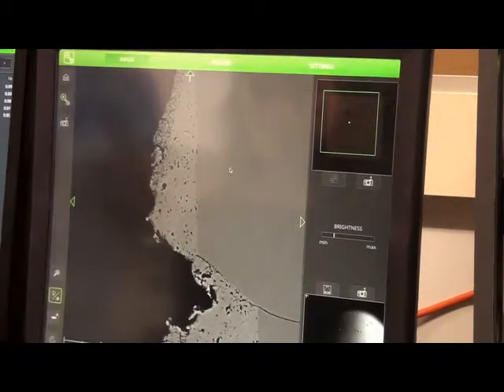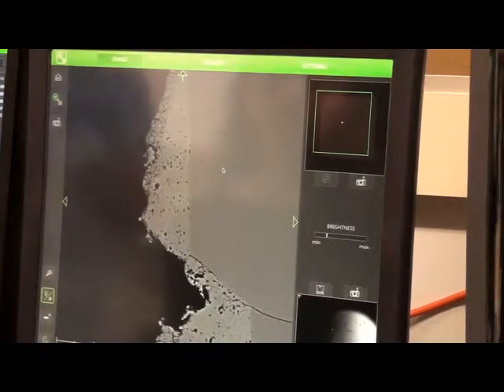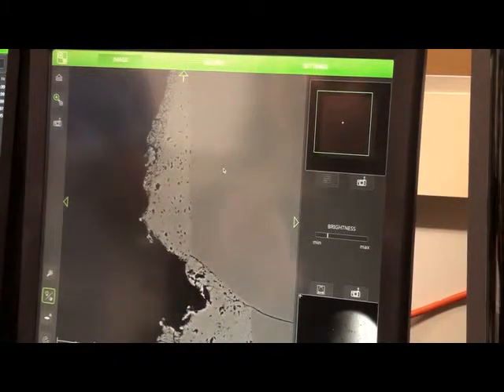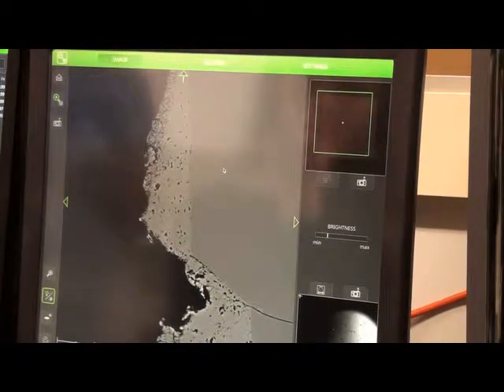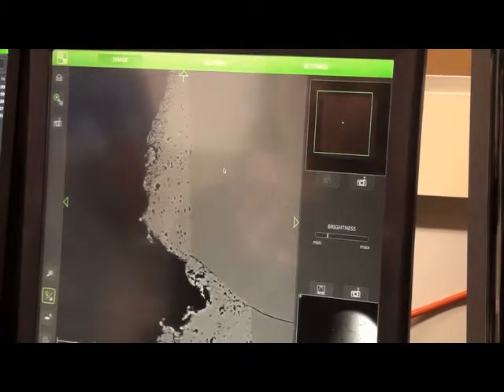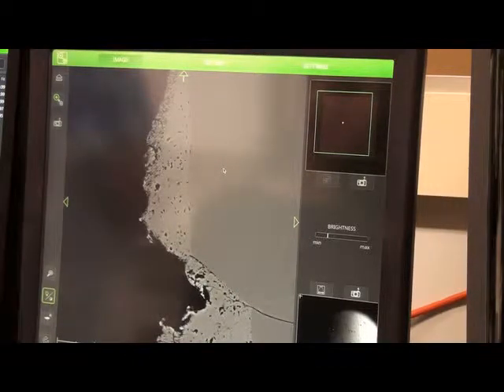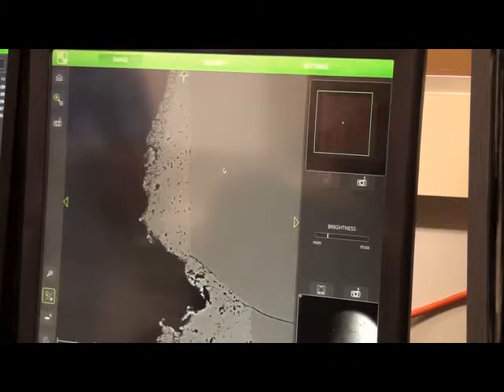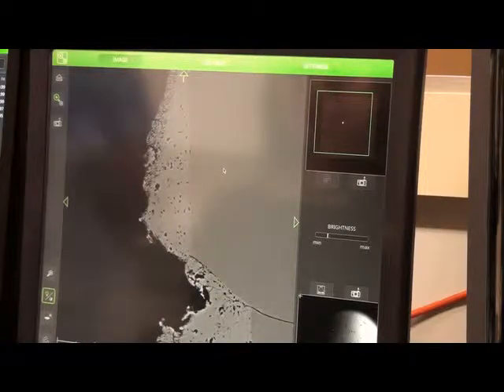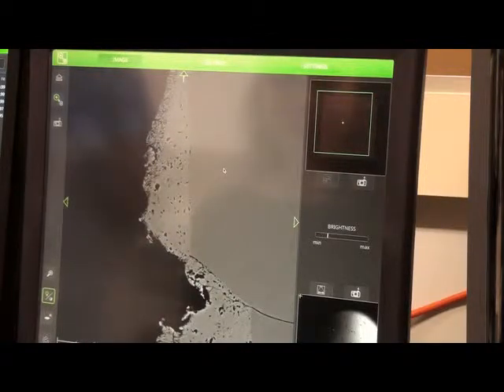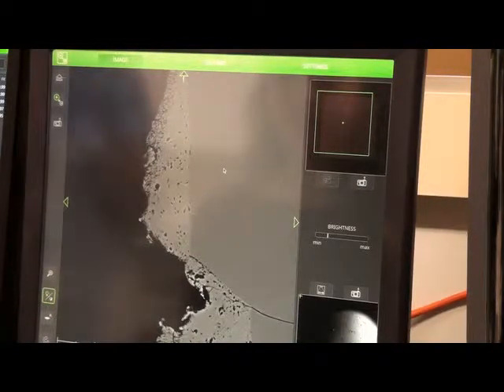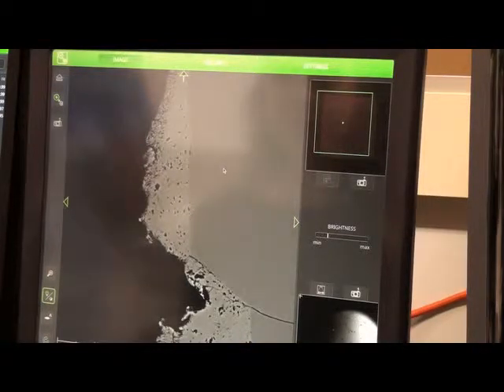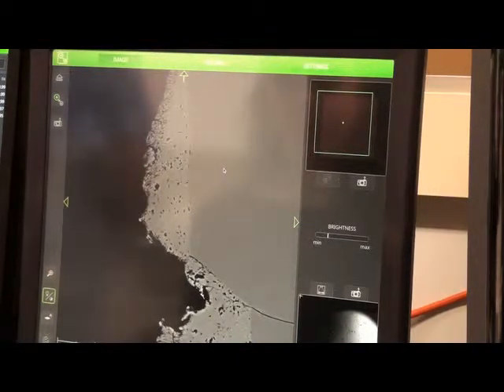So now, what do you... Can you describe the image for me? Yeah. So what we've done is we've altered the contrast and the brightness so that we can no longer see that more silicon-rich mineral phase.